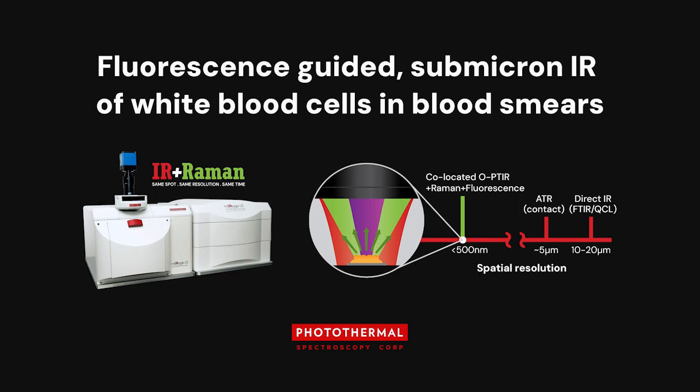Actually, I'm glad you mentioned that, because the amount of glass is going to depend very much on your thickness. There is a certain thickness beyond which glass doesn't impact at all. So your typical histological sections that are, say, 7-10 microns and above, glass typically has zero contribution. And when you get lower than that, then the amount of glass becomes proportional to the protein band. So the thinner, the stronger the glass will be.